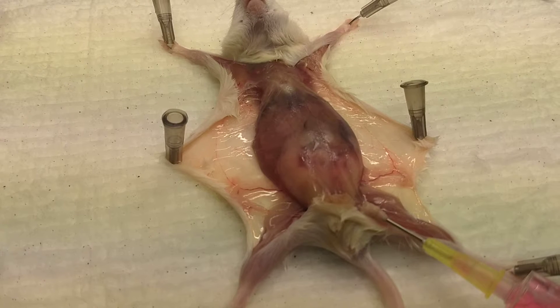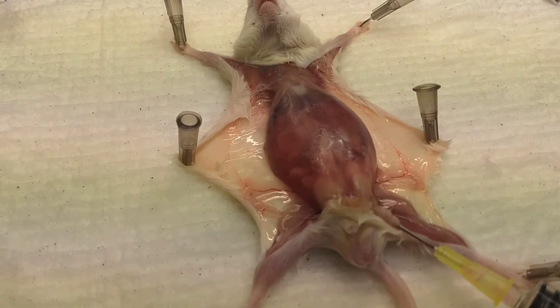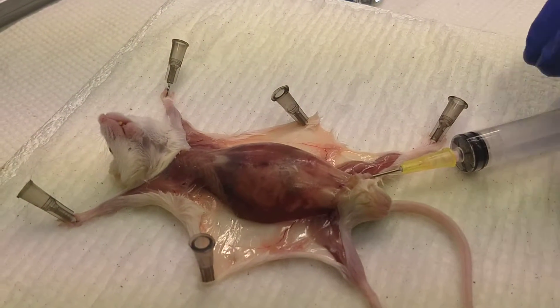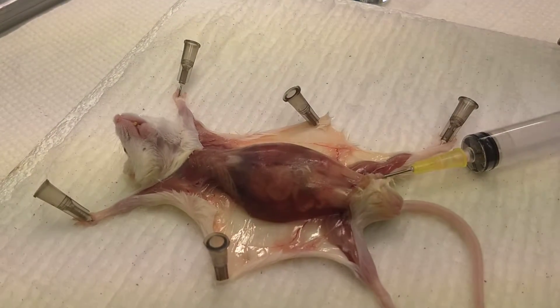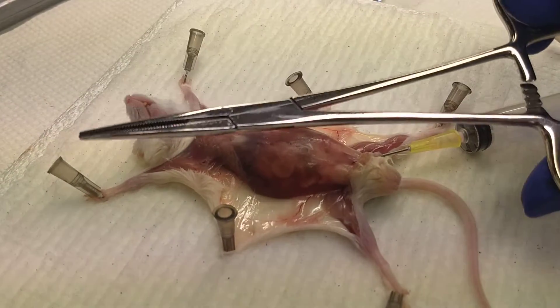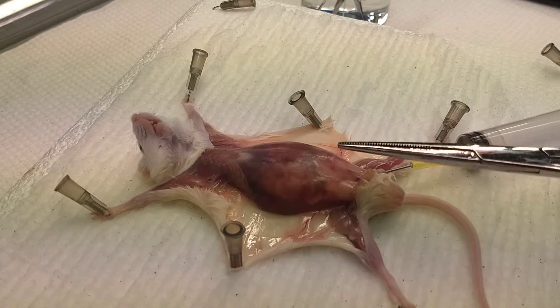Once you're in about halfway the length of the needle, inject the media into the peritoneum — you should see it being filled with the media. If you don't see it being filled, it's likely that you have a blockage somewhere. I'm going to leave the needle in; you can also take it out without causing media leakage. Then you're going to use a hemostat — basically a clamp — to crimp onto the peritoneum.